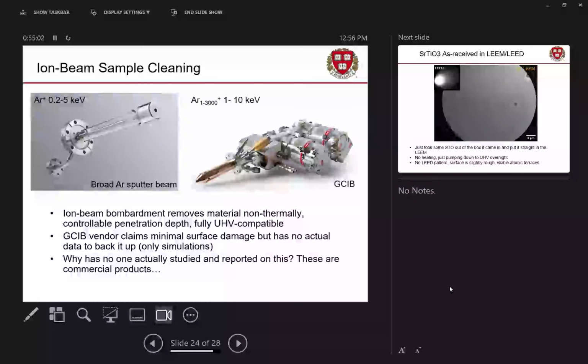The alternative is something kind of different, and that's called gas cluster ion beams. These are very funky. Instead of using individual atoms, they actually use big droplets of atoms, like droplets of argon, which is a funny concept. But you can get a droplet of argon containing several thousand individual atoms, ionize it, send it through the same kind of beam optics, and now you've got a beam of argon droplets. And the reason that matters is those droplets aren't really bound together in any way. When they hit a sample, they kind of burst like a snowball, and the effect is much, much gentler.